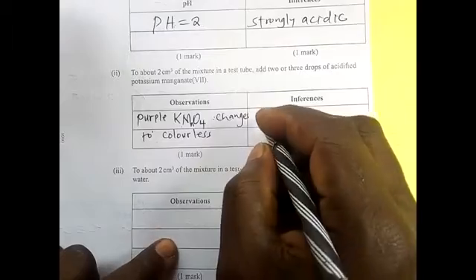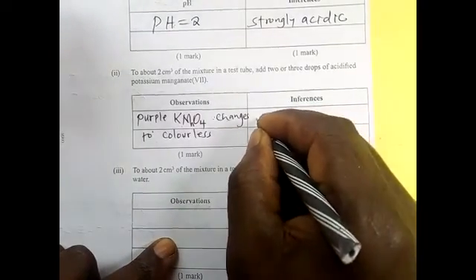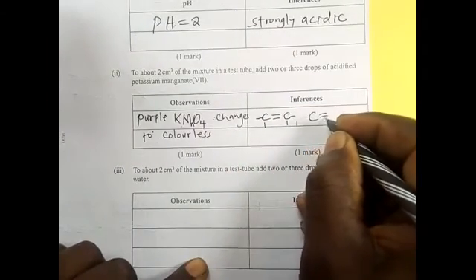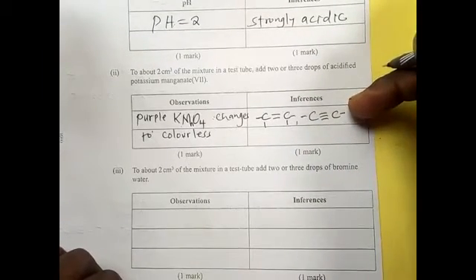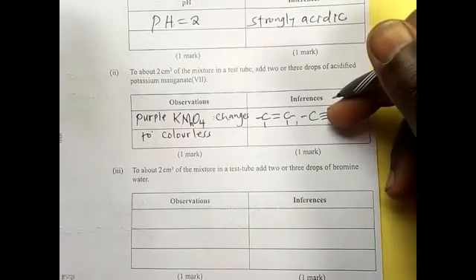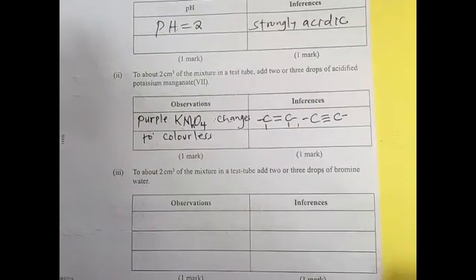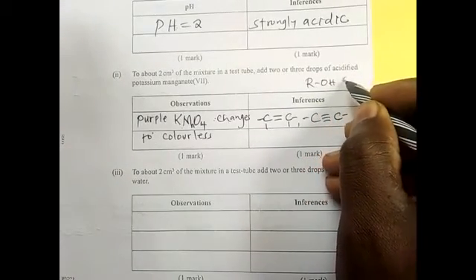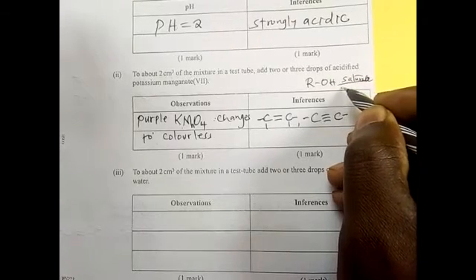It simply tells us that there is a double bond, unsaturated, or a triple bond. There is also an alcohol. But remember, alcohols ROH are saturated organic compounds because they burn with a blue non-sooty flame.